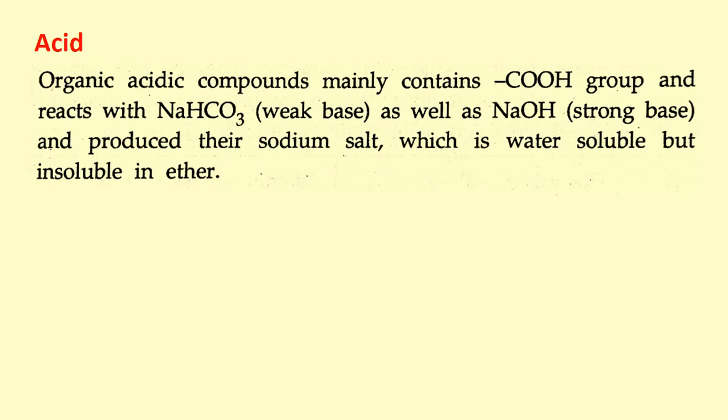RCOOH, where R means any group like methyl, ethyl or phenyl, reacts with NaHCO3, the bicarbonate.